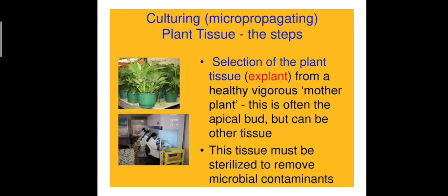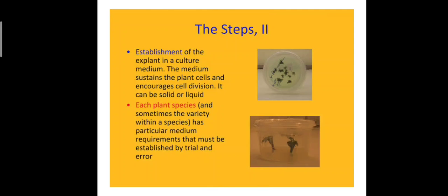And after that, the second step comes. The second step is subculturing. When the callus has grown or the shoot is initiated, we have to transfer the tissue to another fresh medium after a period of time, say after 3 or 4 weeks.